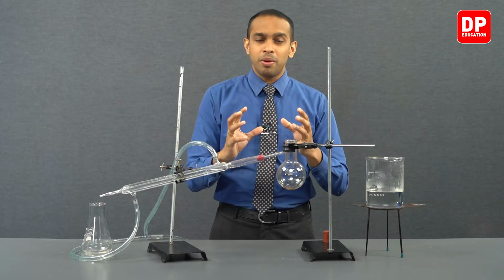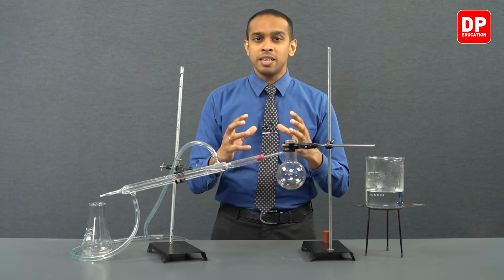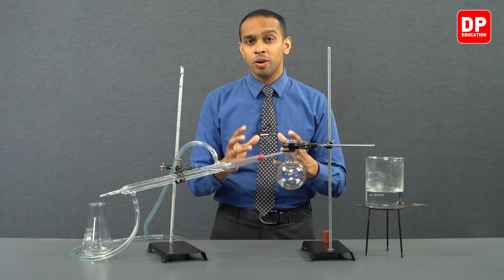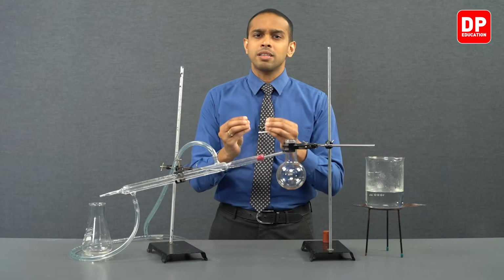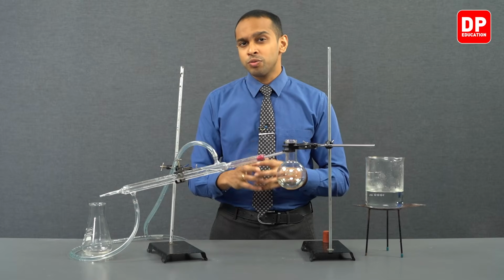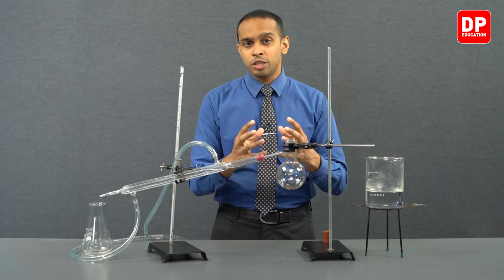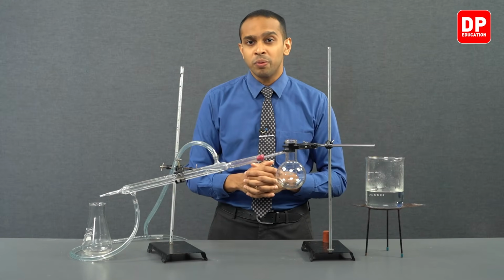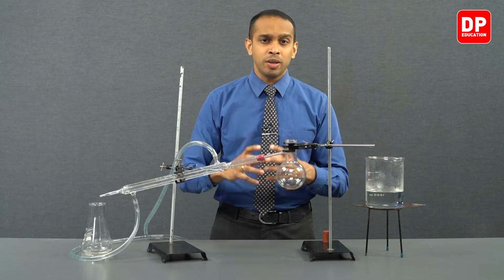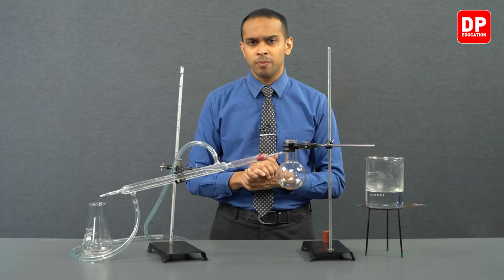So this particular method of extracting essential oils is beneficial to us because you will not need higher temperatures to extract the essential oil. Because when you're trying to boil essential oil on its own by increasing the temperature all the way up to its boiling point, majority of the time the essential oil will get decomposed before reaching its boiling point.